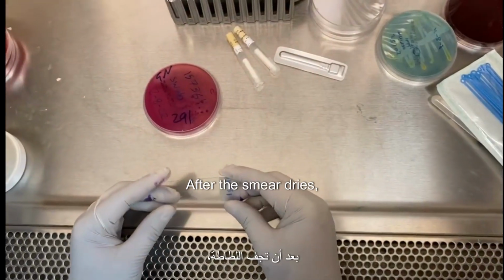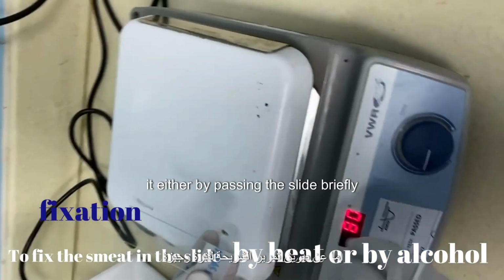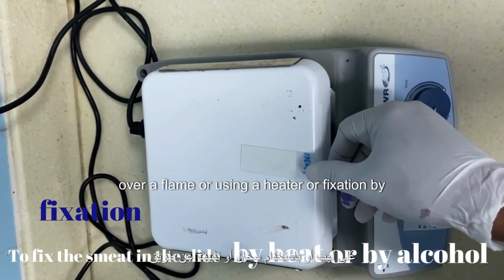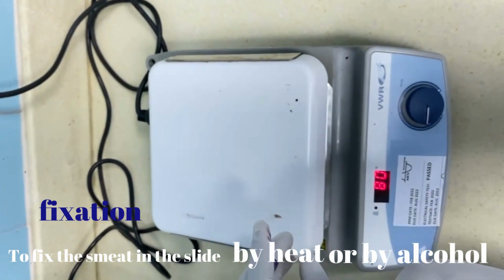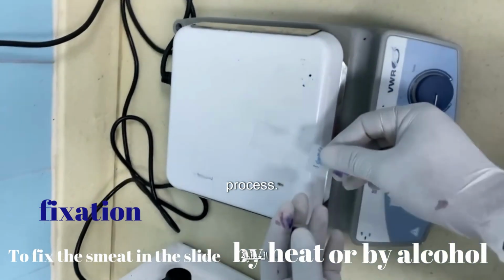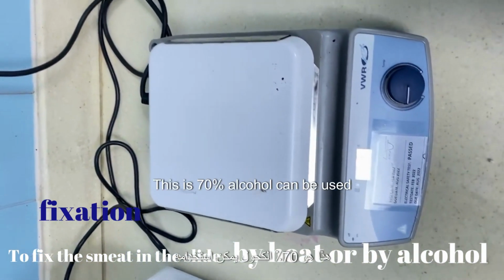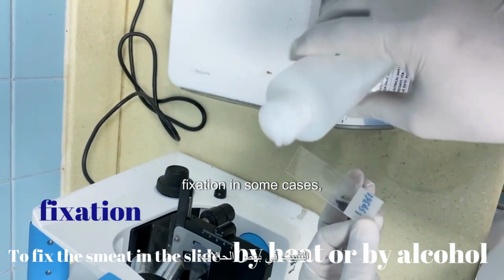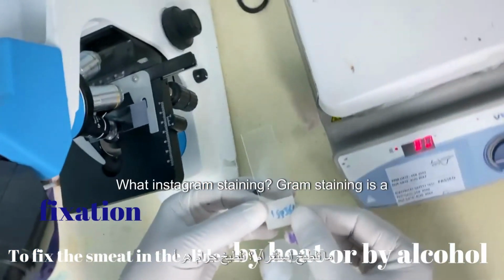After the smear dries, we fix it either by passing the slide briefly over a flame or using a heater, or fixation by alcohol. Fixation ensures that the bacteria are attached to the slide and are not washed away during the staining process. The alternative method for fixation is alcohol. 70% alcohol can be used for fixation in some cases, although heat is a more common method in the microbiology lab.